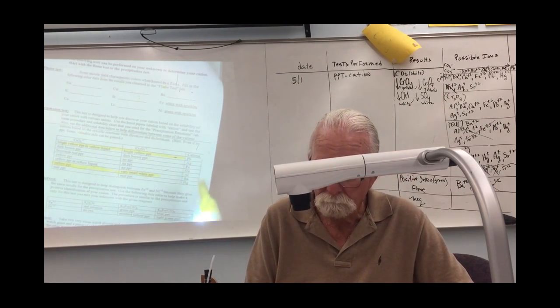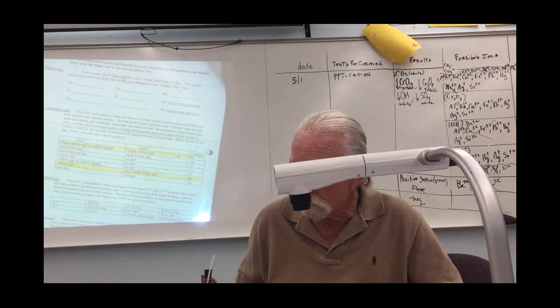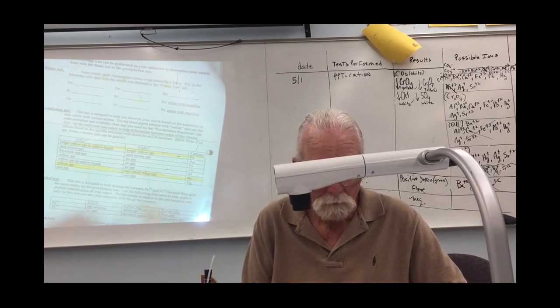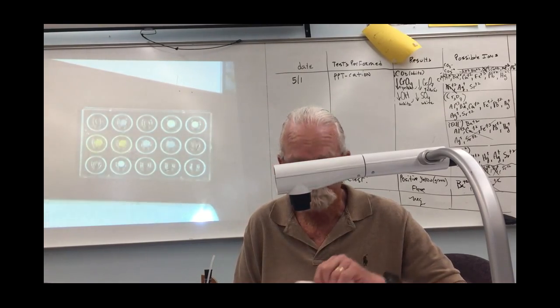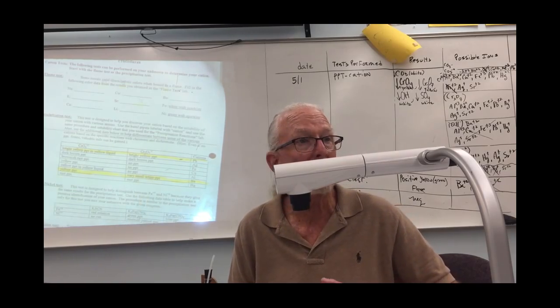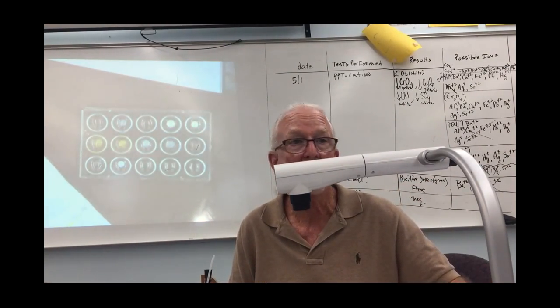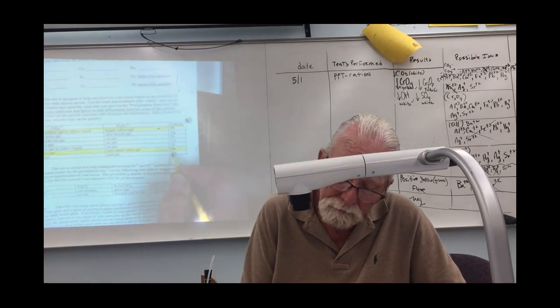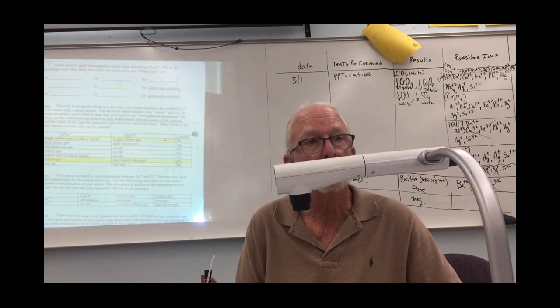What's the next one? Mercury. What color is mercury in chromate? Do you see blood red right in there? No. And in dichromate, it doesn't precipitate. Well, guess what? Mercury's not in there, is it? My unknown is not mercury. So I can eliminate that. What's the next one?